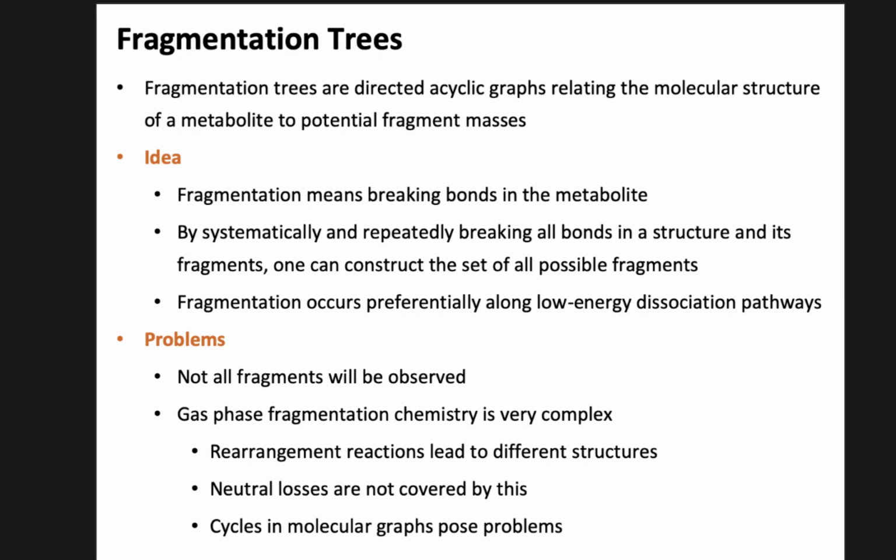you can try to learn these things. And you can try to enumerate all of them. And the 2 things are kind of contradictory, but I'll show you how you can do both. If you enumerate all of the possible fragmentations and then learn which of them are likely, then you end up with fragmentation trees that are helpful for the identification.